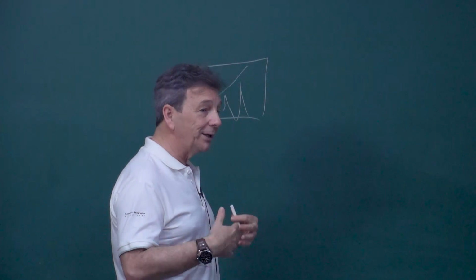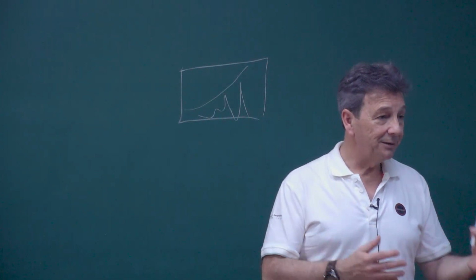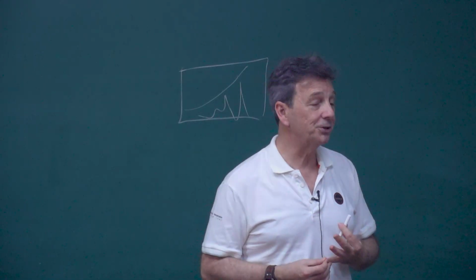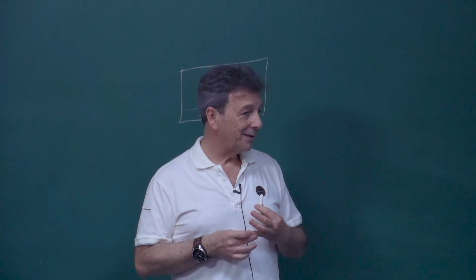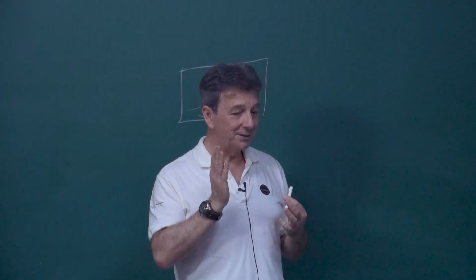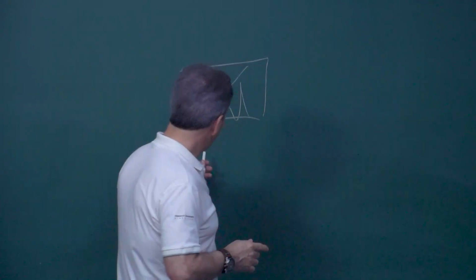But now, because systems are becoming faster and more sensitive, there is a company in Finland called TimeGate, which has started making very nice Raman systems. It is called TimeGate because it is pulsing the laser. Why? Because the Raman phenomenon is very fast.